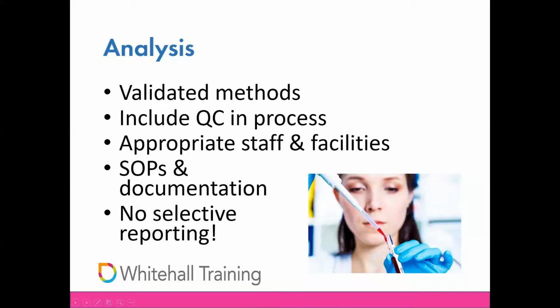Routine system suitability tests, such as the use of QC samples, ought to be done as standard during the analysis. The nature of these tests and the acceptance criteria, again, define this as part of the validation and then implemented consistently before you start any work. I'm going to say this again, and I've said it several times, both the equipment and personnel should be fit for purpose, and you need to consider any factors that could affect the results.